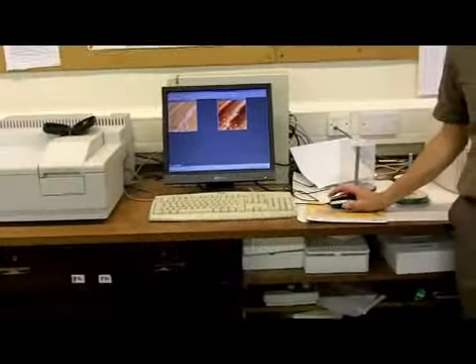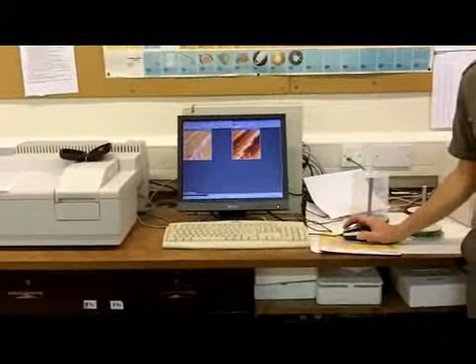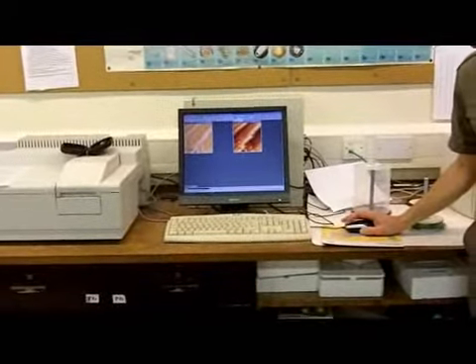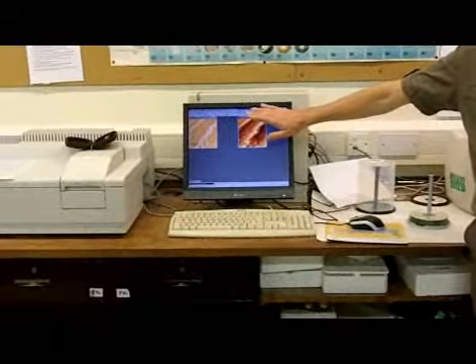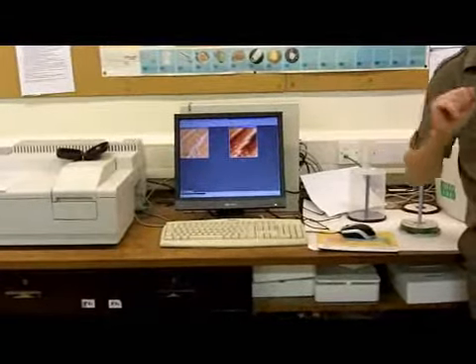So what we need to do is flatten it. And again, that's one of these up here, and it's this little button that looks like two sheets. Again, you've got an option. You've got a local plane or a global plane. The global plane in this case isn't any good to us because it'll try and flatten the image, taking an average over the whole thing. We want it to flatten relative to a small area that we define.